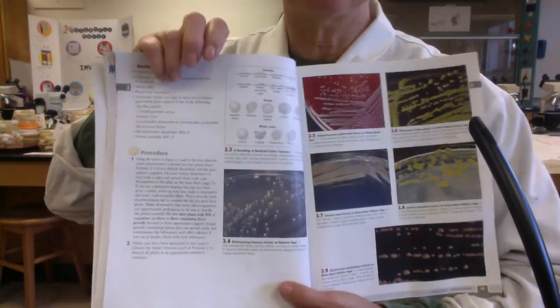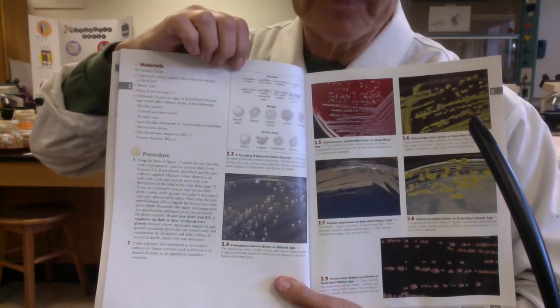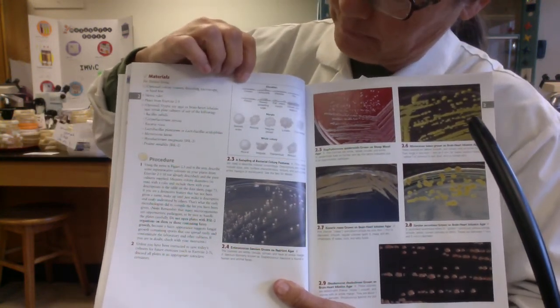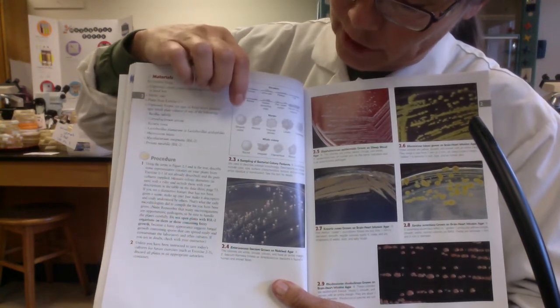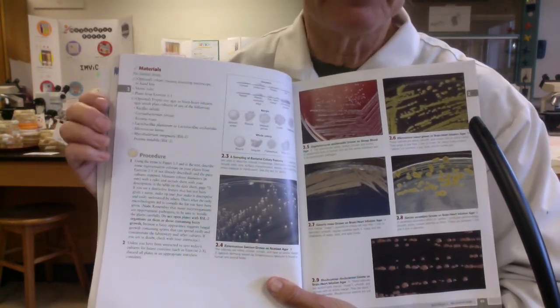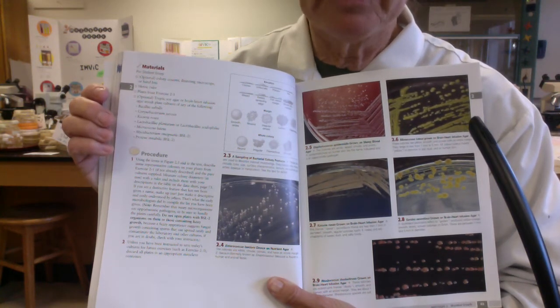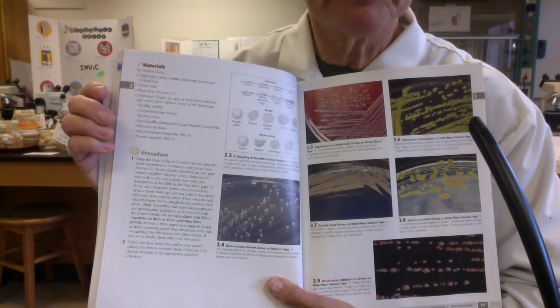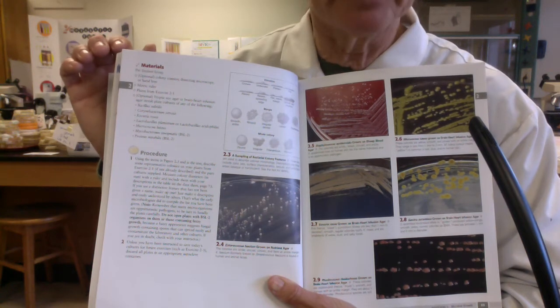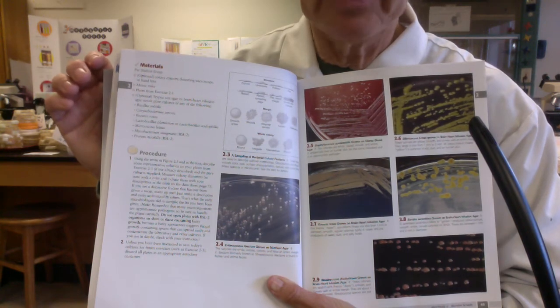This is from a great microbiology lab manual that we're hoping we can adopt, describing all the colony morphologies, all the colony features. So it includes elevation, it includes the shape of the colony, the margin or border of the colony. We'll be describing the pigment, we'll be describing the size, we'll measure the diameter in millimeters, we'll describe the optical properties and the appearance of the surface. So these are all colony traits that you'll be describing and including in your micro workbook to be turned in.